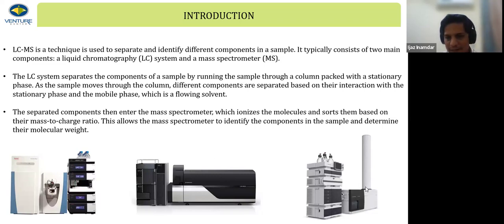So these are the typical, these are not the only, but are typical mass spectrometers that are currently available in the market. As Edna pointed out, we have NCBA, that's the Center for Biopharma Analysis. We have the Orbitrap model with us, and in the CAMPS facility, we have a QTOF model with us. We'll talk about what is QTOF, what is Orbitrap, what are the principles of that.